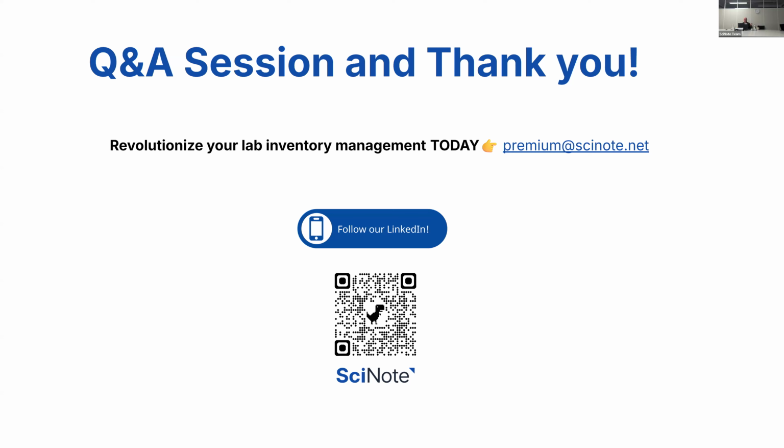Not quite. Okay, then what I would ask you, Sarah, so we don't go into too much detail here, is to please reach out. You can also reach out to me at veet@sciNote.net, and also to your customer success manager, because I'm not sure who it is. Here's my email, and you can also use support@sciNote.net. Include both emails, because I may lose emails while support is monitored by multiple members of our team all the time. So reach out and let's dive into the specific use case.